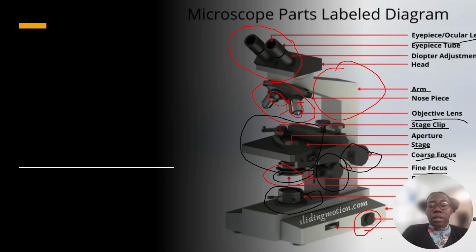So this was it for the video about the microscope, its function, and the different parts.